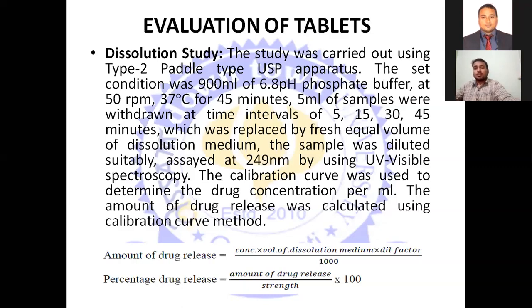Five ml of sample is withdrawn at time intervals of 5, 15, 30, and 45 minutes. After each withdrawal, the volume in the chamber is maintained at 900 ml by adding fresh pH 6.8 phosphate buffer. So every time we take a 5 ml sample, we replace it with 5 ml of phosphate buffer to maintain the total volume at 900 ml.